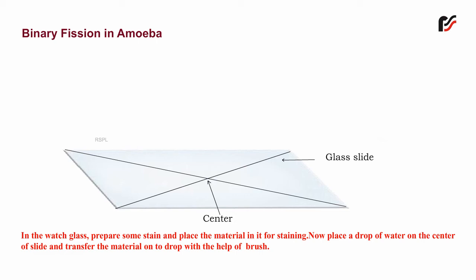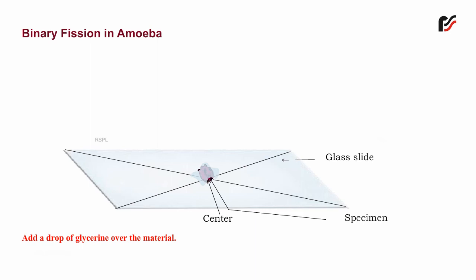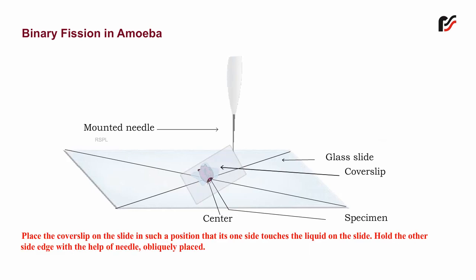Now place a drop of water on the center of the slide and transfer the material onto the drop with the help of a brush. Add a drop of glycerin over the material. Place the cover slip on the slide in such a position that its one side touches the liquid on the slide.